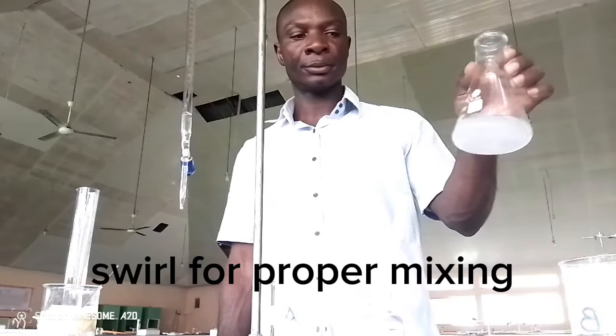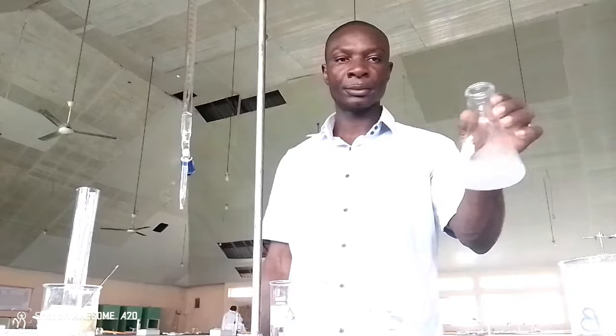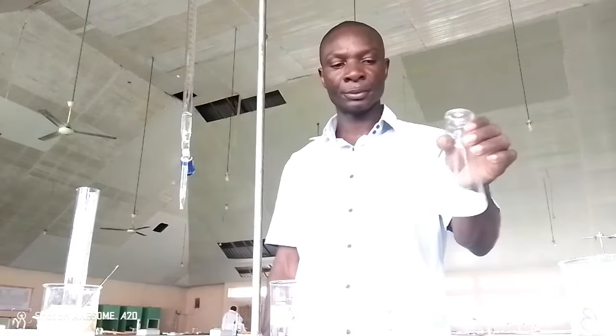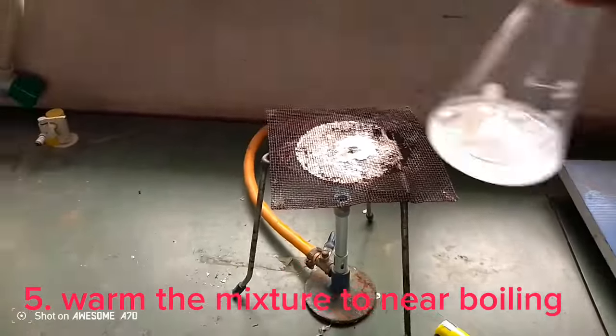Swirl for proper mixing. 5. Warm the mixture to near boiling.